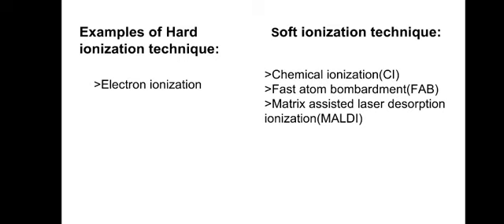Soft ionization technique examples are chemical ionization, fast atom bombardment, and matrix assisted laser desorption ionization, which is also known as MALDI.